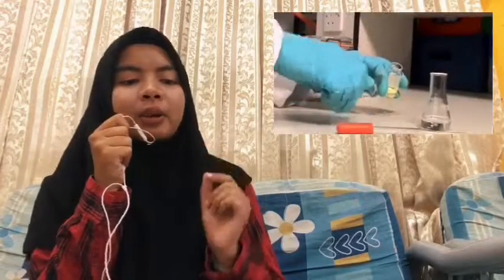The next way for sample preparation is solution. Let's begin with a small amount of sample added into the sample vial, and then solvent is added to prepare approximately 5% concentration.